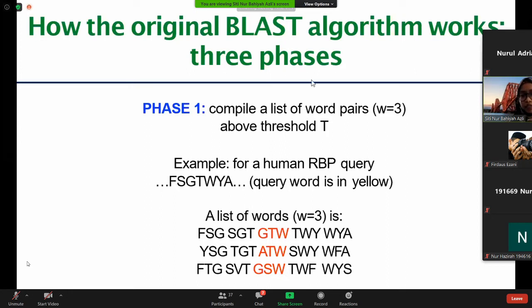Which have three phases. This is highly important because before you choose your settings, parameters, algorithms, you need to know why you are choosing it, why you are changing it from the default parameters, just in case people ask you why you chose a value other than the default parameters, and you will have your own reasons.